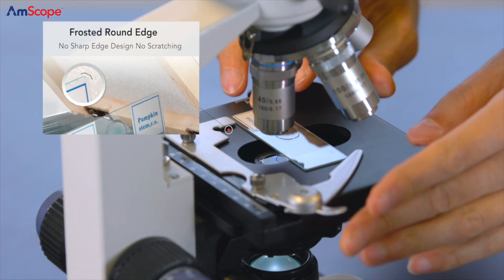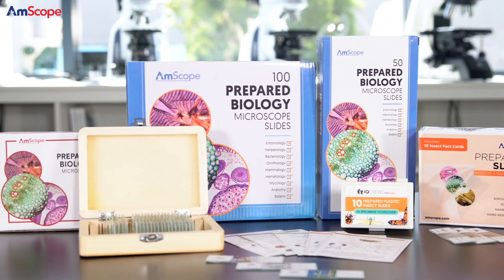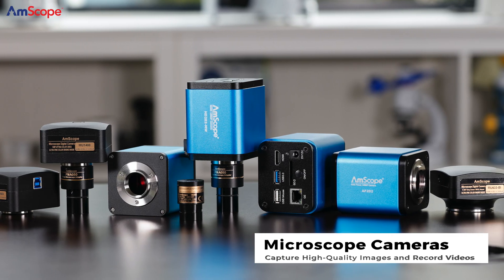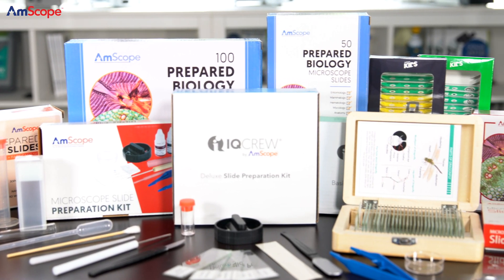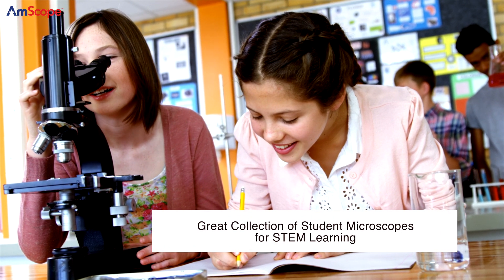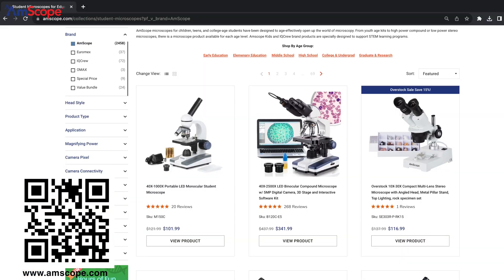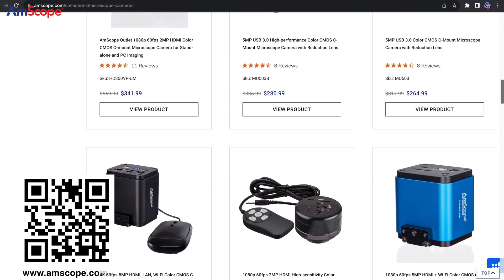Of course, there's so much more Amscope can offer, including a wide range of slides, both blank and prepared, and digital eyepiece cameras that will bring your school lab to life. We are here to meet your needs delivering quality products and superior customer service. So check us out! For more information, check out the QR code on the bottom of the screen. Thank you so much for watching, and we look forward to being of service to you!